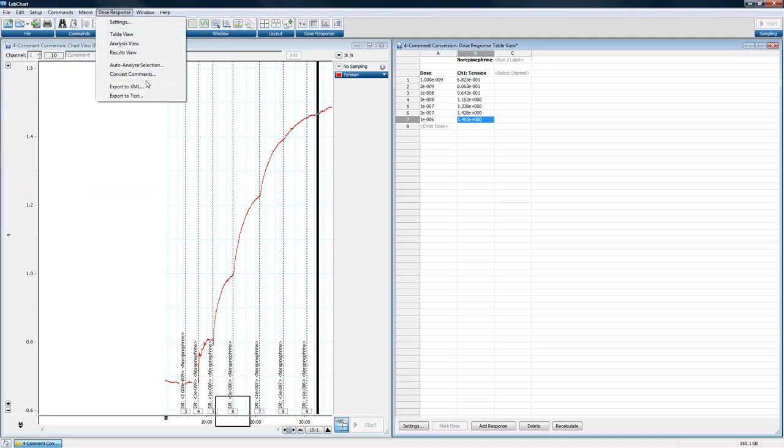So this is a rather quick webinar. I know I moved through here fairly fast. So that's everything I wanted to cover today, so we'll go ahead and move on to any questions that may be out there.